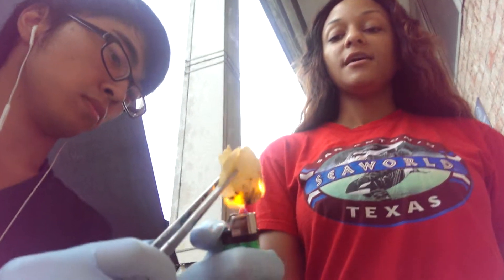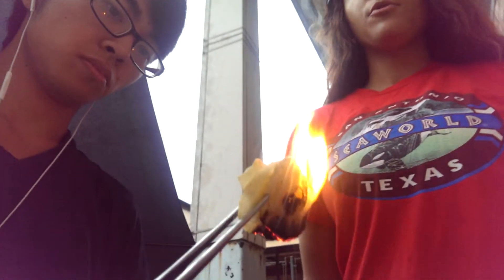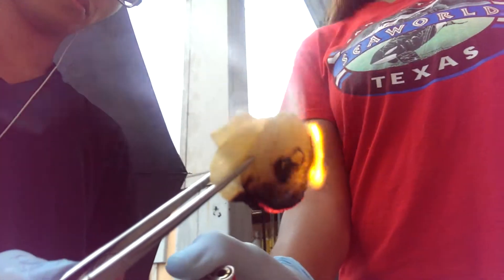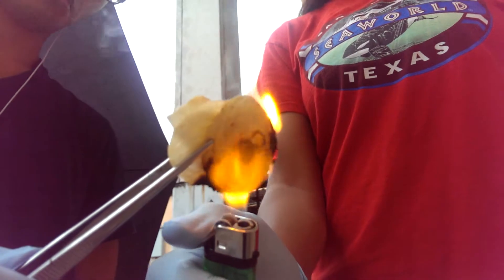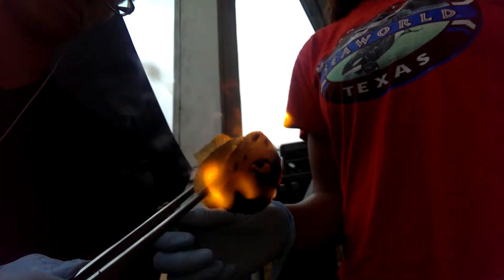As the potato chip burns, its initial and final mass will be weighed, and we will be able to calculate how many calories are actually in this potato chip. Just by looking at the amount of burning, we can see that this has a lot of calories.